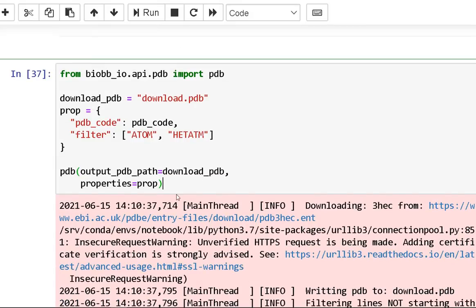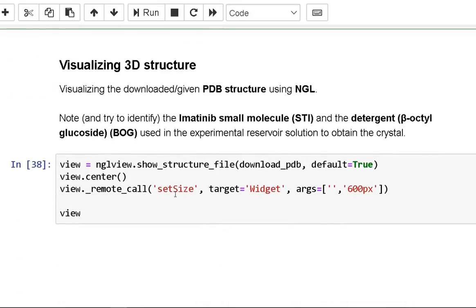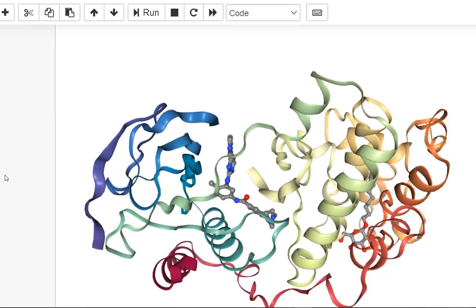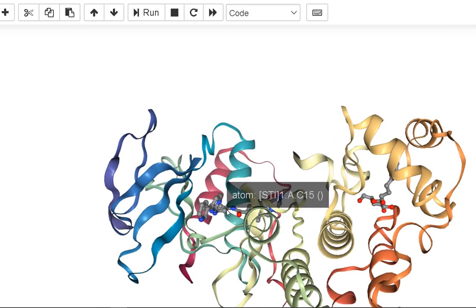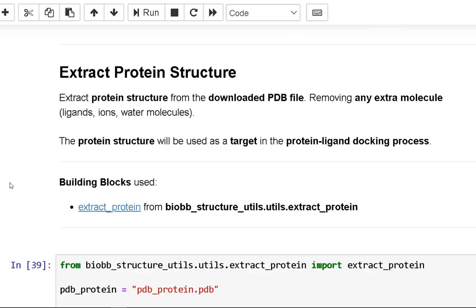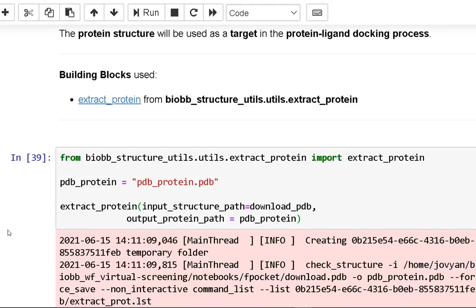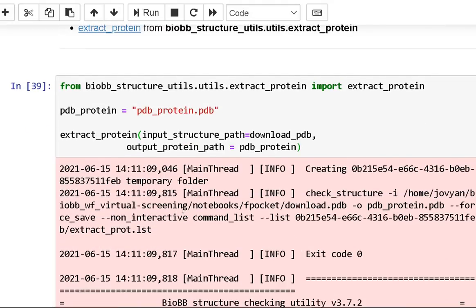In the third step, we visualize our downloaded PDB structure using NGL. You can see the imatinib small molecule STI and the detergent beta-octylglucoside (BOG) here. We will then extract our protein structure from the downloaded PDB file by removing any extra molecules like ligands, ions, and water molecules. This protein structure will be used as a target in the protein-ligand docking process.